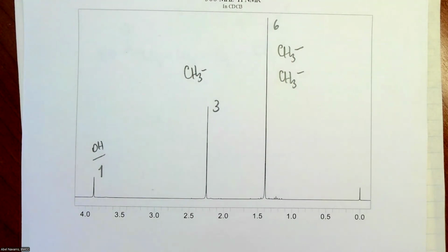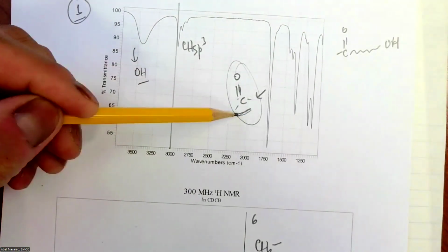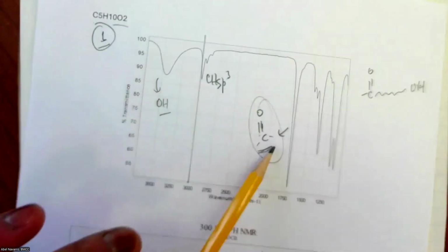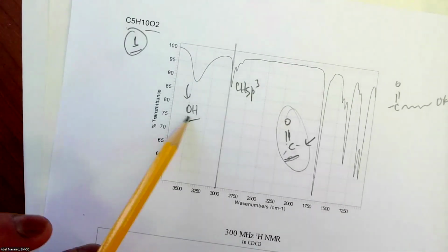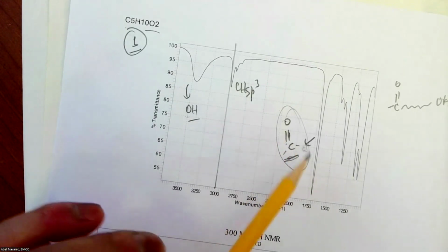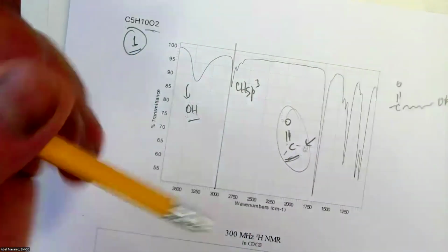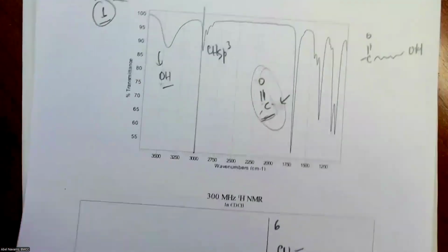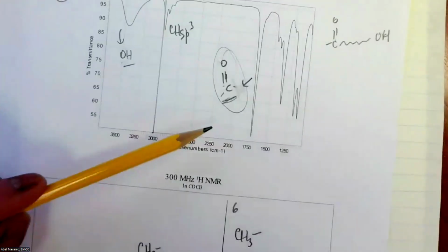Okay, so now since I'm right now in the limbo, right? So now is the time to use the chemical shift. So chemical shift, what peak CH3? Well, I know I have a ketone. And I don't have an ester. How do you know that you don't have an ester? Because you have a COO, but you have an oxygen. I cannot have an ester because if I do an ester, it will be 3 oxygens. I don't because I only have 2. So it has to be a ketone or aldehyde. I know it's not an aldehyde because aldehydes give me a chemical shift around 9, 10 ppms. So it has to be a ketone.